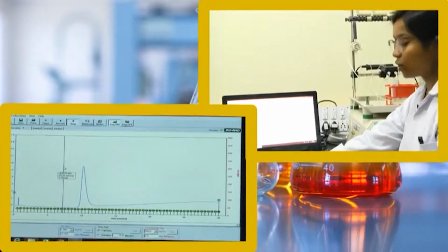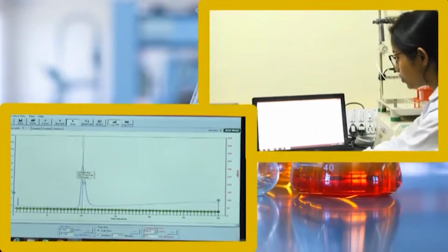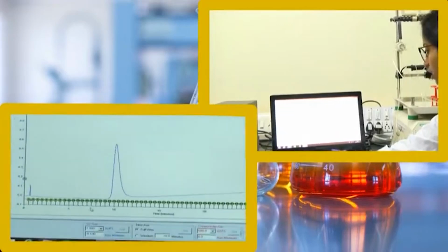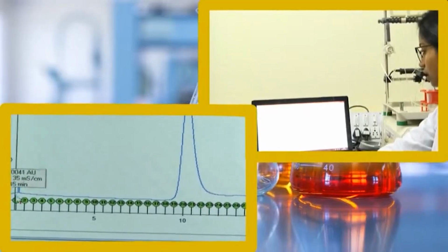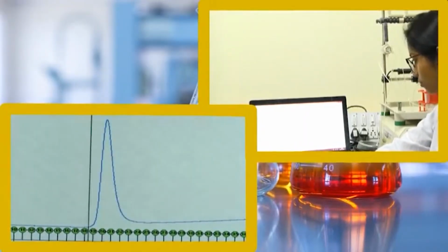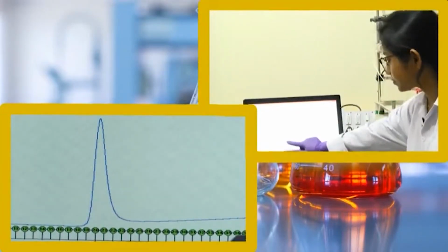We are hoping that our protein is present in this peak, and if you zoom into it, you can see the small green flags denote the fraction numbers. At this peak hump, fractions 18 to 23 are there.